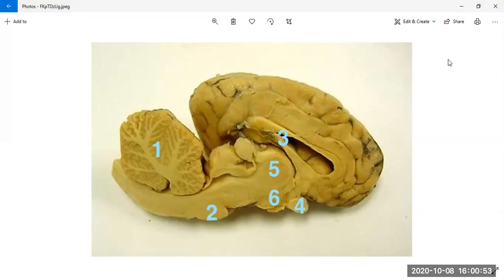Hello, everyone. I'm just trying to go over the live pictures we took at Baruch. I'm not going to take a lot of time because, on the test, I'm not going to ask you every detail. I'm just going to go over the major organs or major tissues you need to recognize.